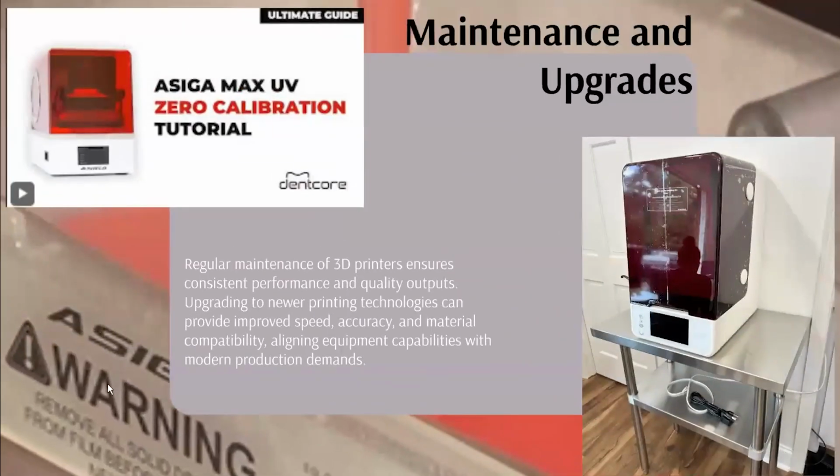So equipment, right? Again, I think I said this a minute ago, you've got to calibrate it, keep it maintained, and clean it. That way, you keep things going well. And then upgrades. I just added the Ultra to my line, and I'm telling you, it's exciting. You use the Max for several years, and then this thing comes along, and it's just cool. So upgrades are a thing.